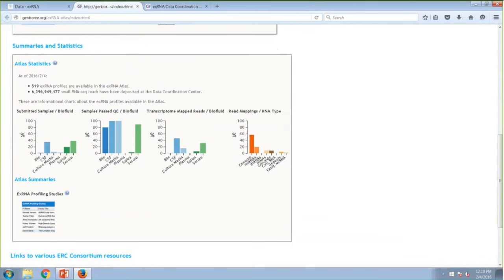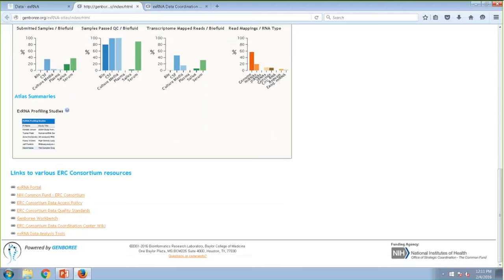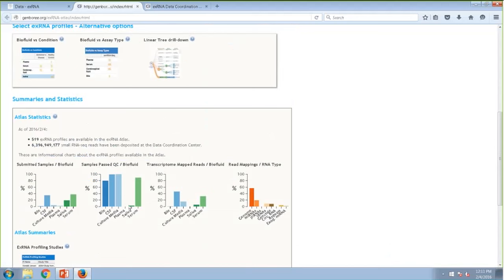Further down the page, you'll see summaries and statistics — informational charts giving you a sense of how many samples are available, what percentage pass QC, how many profiles there are, how many small RNA-seq datasets have been deposited at the DCC, and so on. At the bottom of the page, there are useful links — tutorial pages, wikis, the consortium's data access policy, quality standards, and contact information.